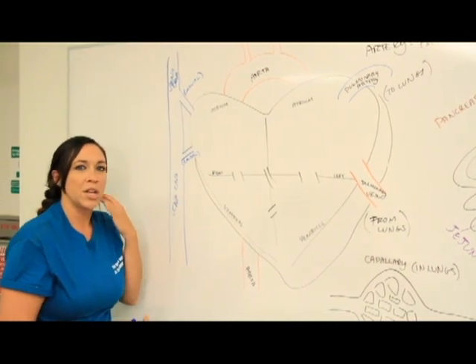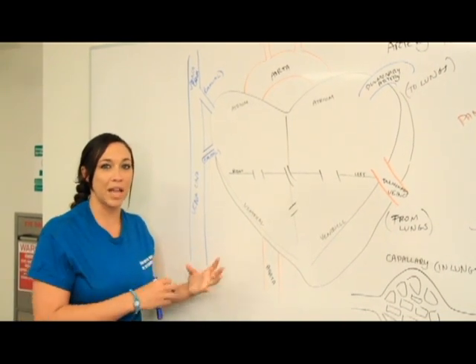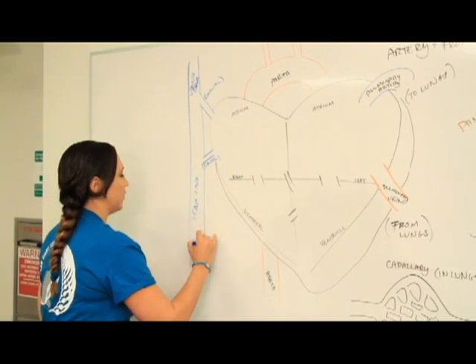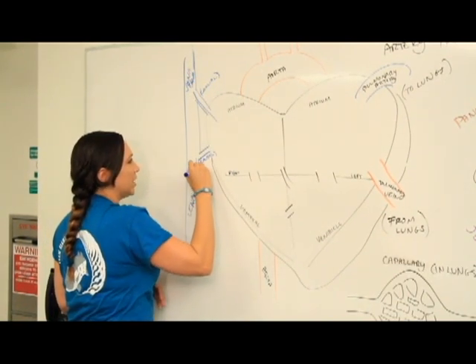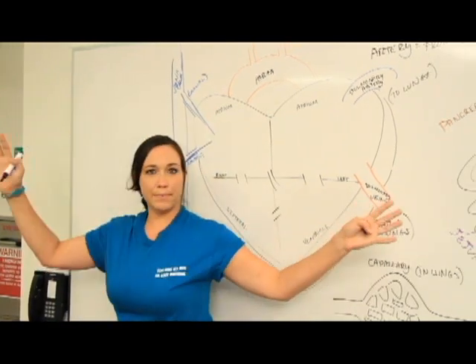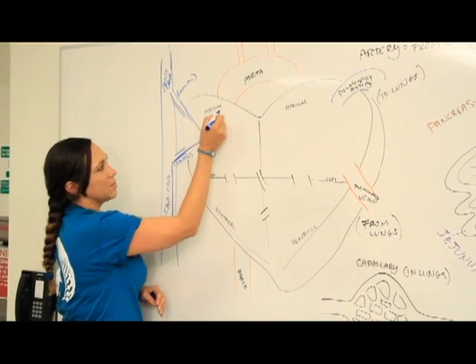That's very important. So you need to remember that veins bring blood back to the heart, where arteries send blood from the heart to the body. So we come in the vena cava, either the caudal, which means below the heart, or the cranial, which means above the heart. And both of these will enter into the right atrium. So again, this is my right, the pig's right. So this is my right, it comes in the right atrium.